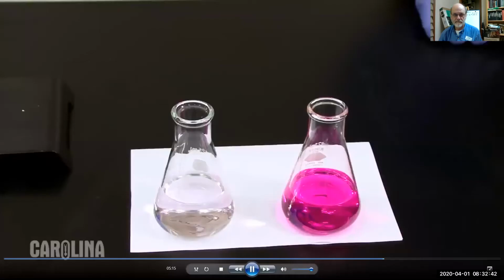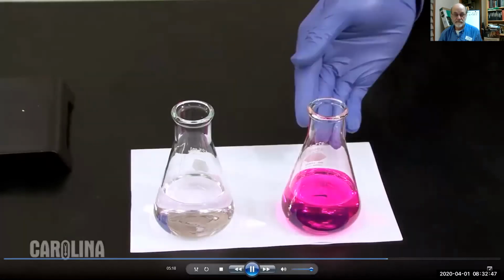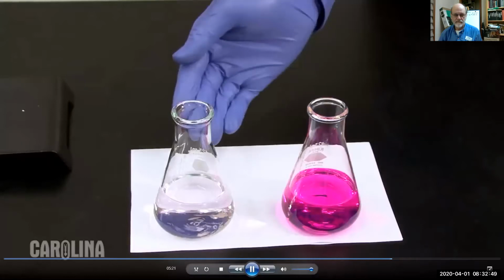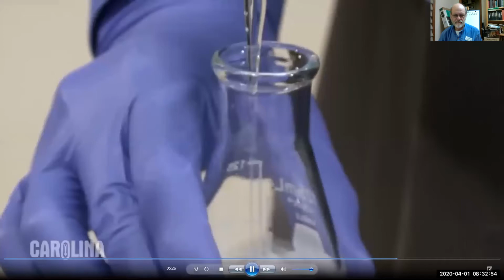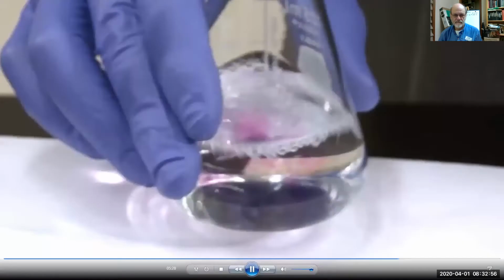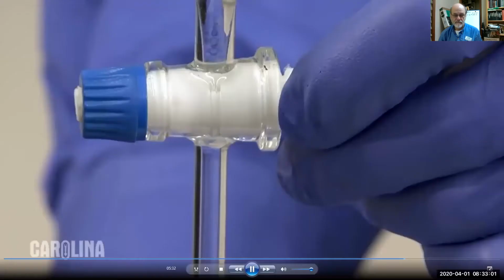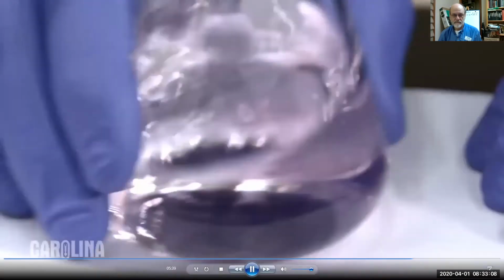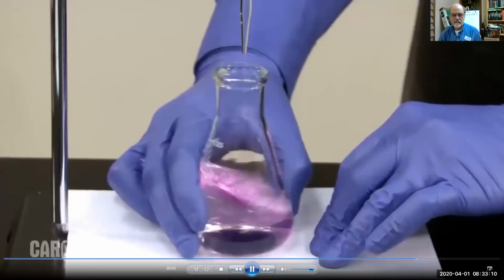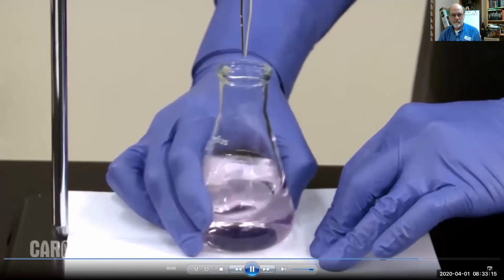As the estimate titration shows, a dark-colored solution indicates an excess of titrant has been added. The desired endpoint is a pale, faintly colored analyte. To reduce the risk of passing the endpoint, slow down the addition of titrant when flashes of color begin to appear in the analyte. Adjust the stopcock to slow the flow of titrant to a drop-wise rate. Continue to swirl the flask with one hand and keep the other hand ready to close the stopcock. When you notice the indicator taking longer to fade, close the stopcock.